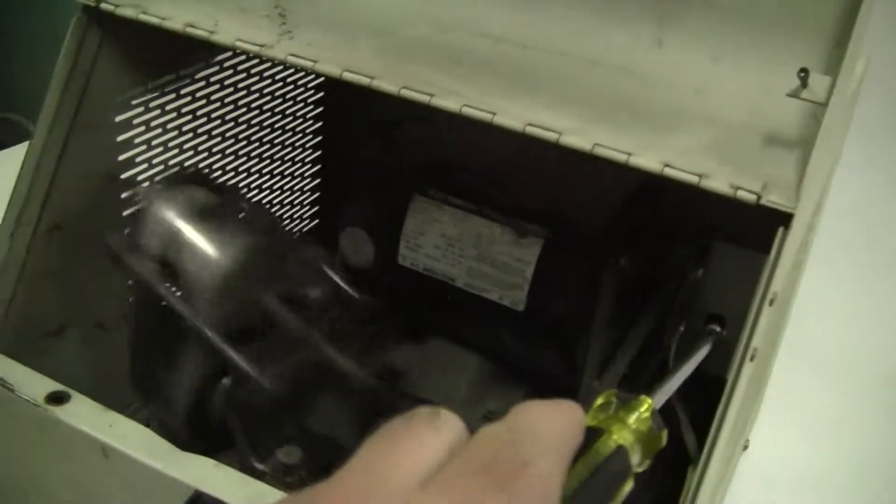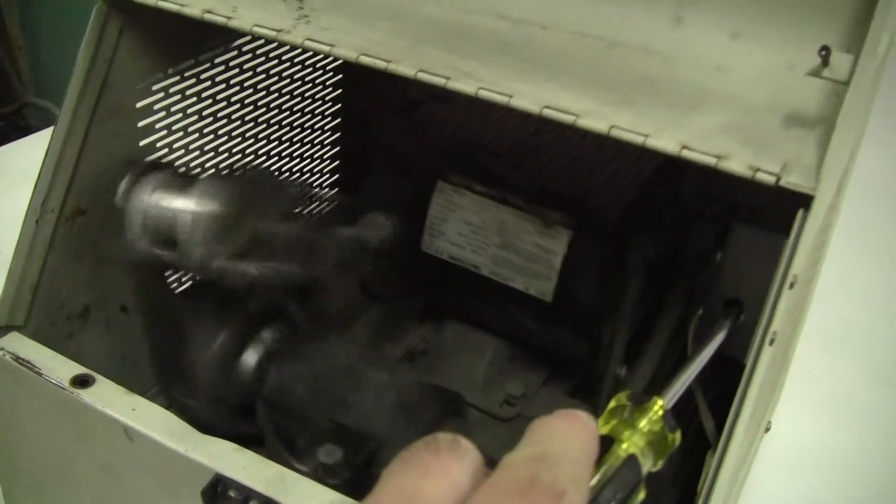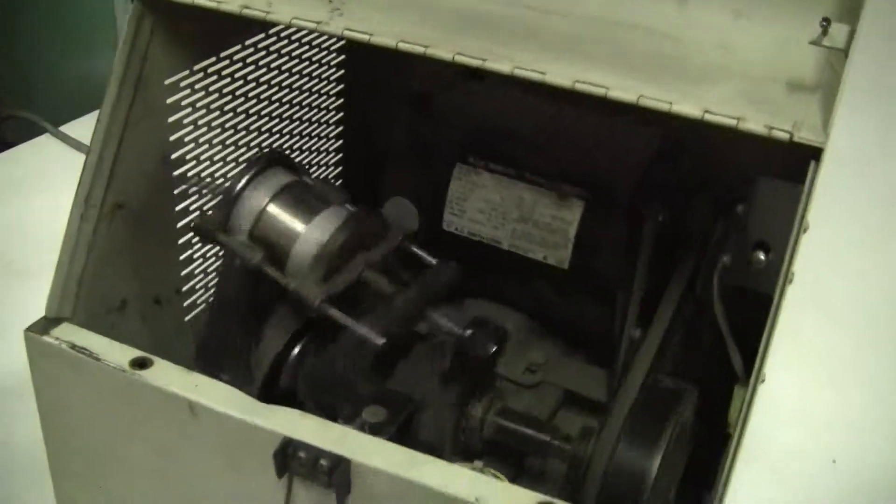That's the safety. Let's see if I can override it so you can see that. Okay, you're all set — great.